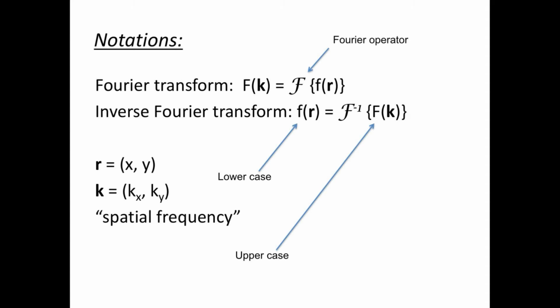So when you do program development or algorithm development, you go into the space you're comfortable in at any given time. Okay. So here we have the spatial coordinates and the reciprocal coordinates, or the spatial frequency.